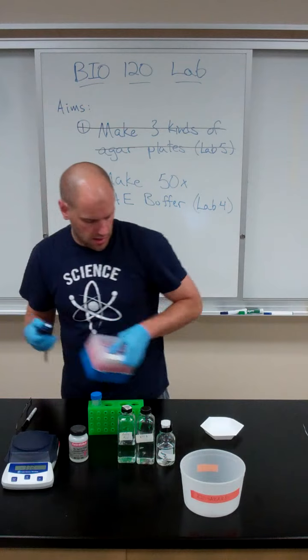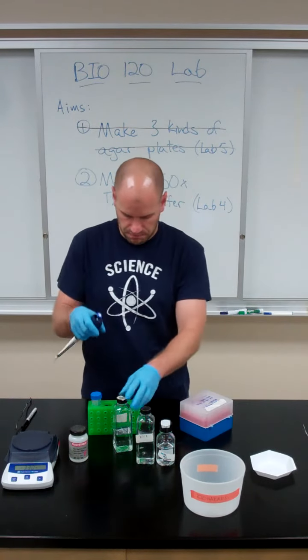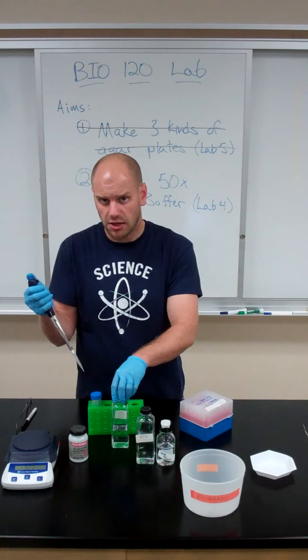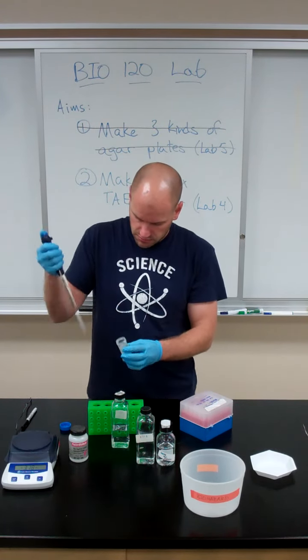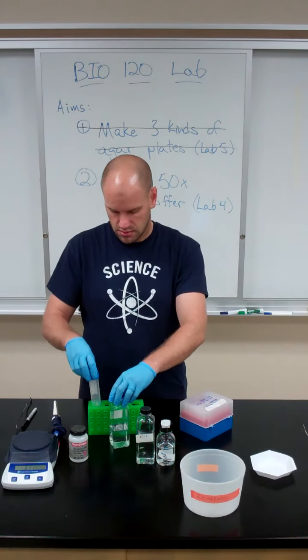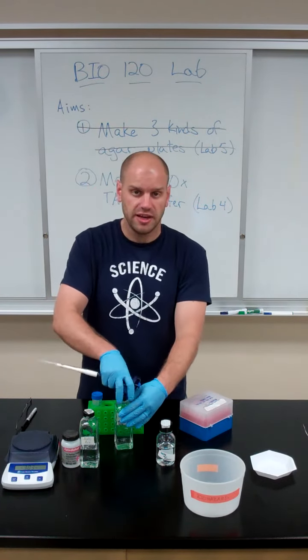Next, I'm going to add my acetic acid. Remember, pay attention to your lab handout as to what concentration of acetic acid you should be using, and pay attention to your calculations as to how much you should be adding. Then I'm going to add my EDTA.